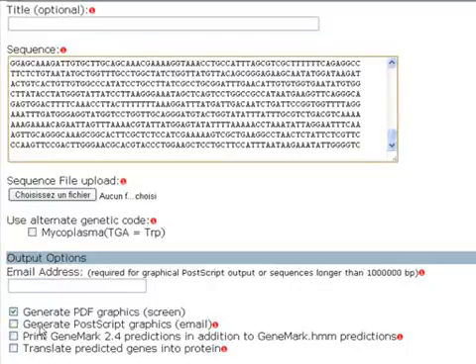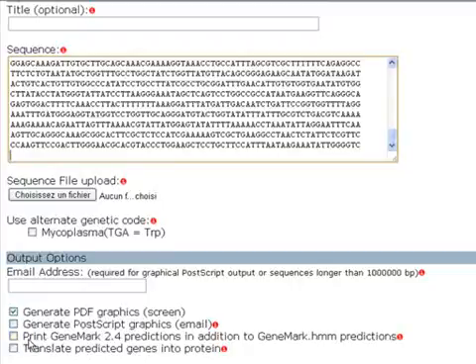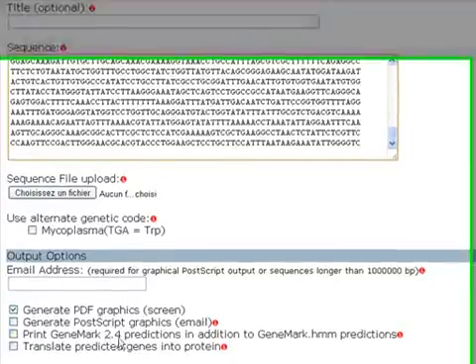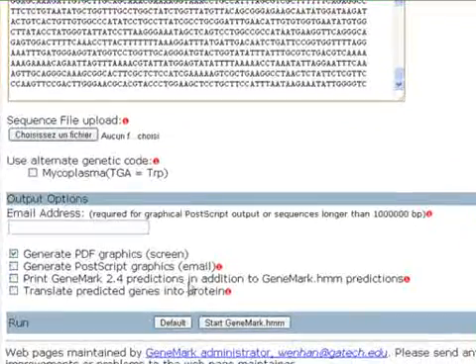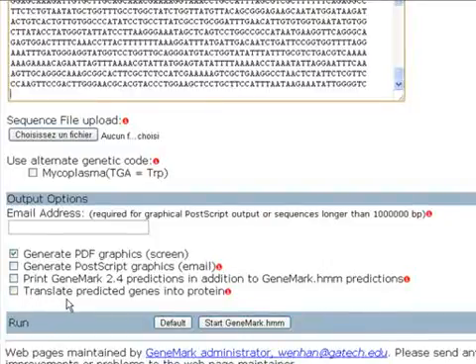The third option is to print GeneMark 2.4 predictions in addition to GeneMark.hmm predictions. And the fourth is to translate predicted genes into protein.